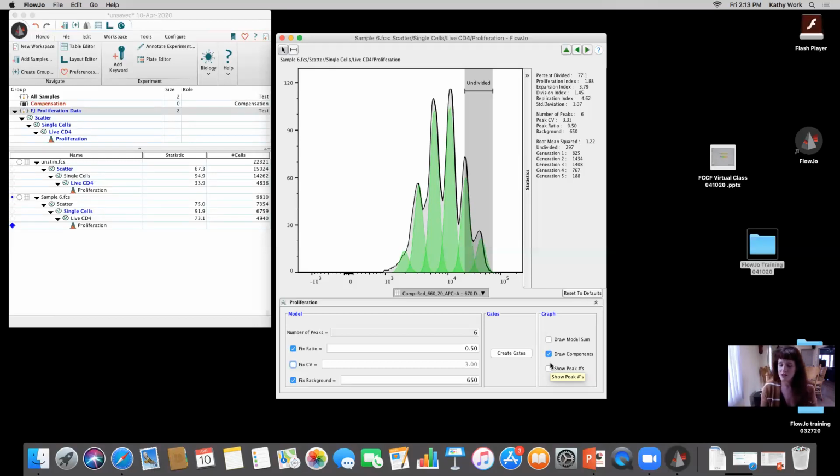To those recommendations, but I don't have that myself. All I know is that yes, you can fix these samples with a fix and perm kit, but I don't know if there's data showing if some are better than others, or are more sensitive to fixation or not.